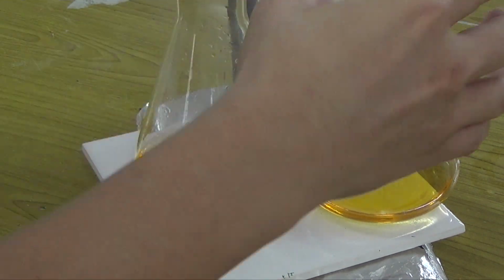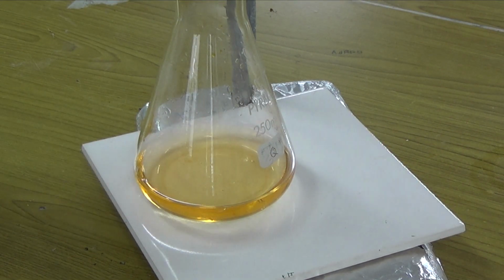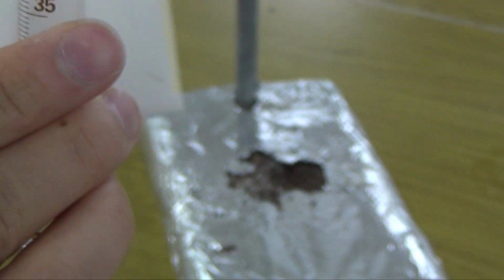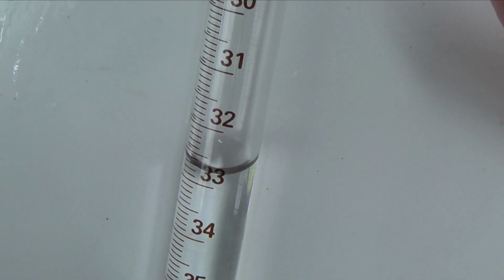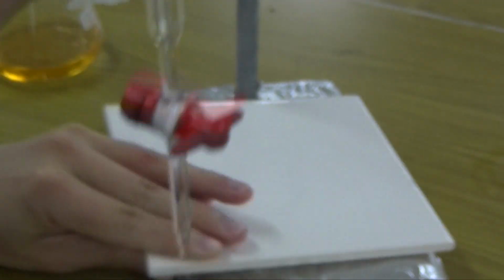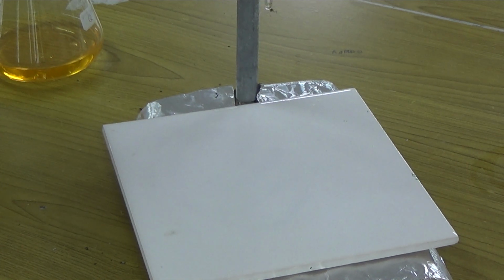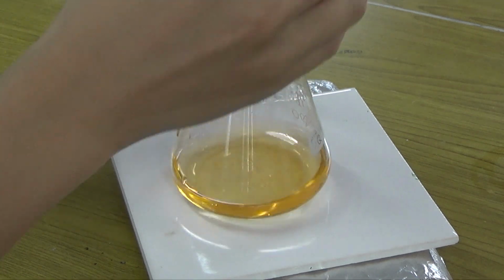Perhaps I could just read the reading first, and if I'm not sure, I can always go and add one more drop. So my reading here is 32.8. Alright, 32.8. Maybe I need to lift this up a little bit. 32.8 minus 10.0, that means it's 22.8. Okay, so that's my exact titer number 1. But you might think, what if I add one more drop? Before you add one more drop, you should read the reading first, okay?